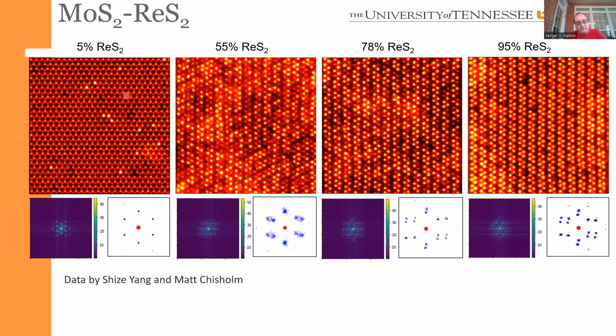This one has a normal hexagonal symmetry. This one is monoclinic. You see this coexistence of two sets of tilted lines. And you can see it remarkably well in the Fourier transform or in the pair distribution function analysis. If we look at the pair distribution function, you can see that there is only one type of neighbor here, so there is a narrow single peak. Then the peaks start to be more disordered. They broaden and they start to split.